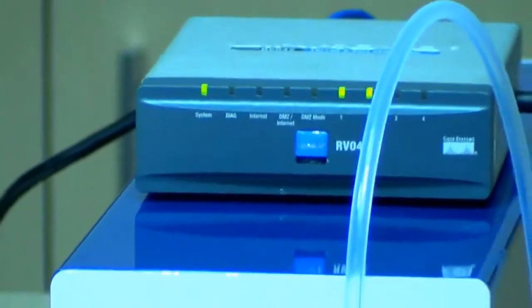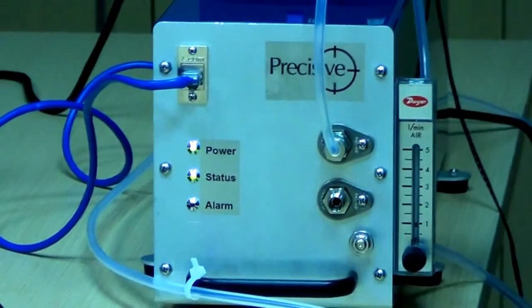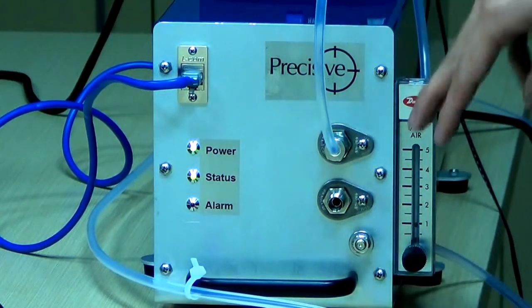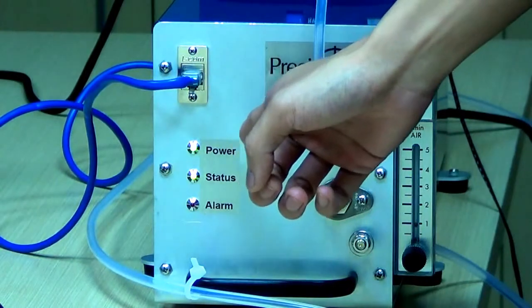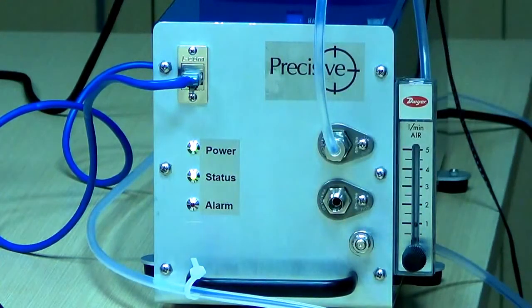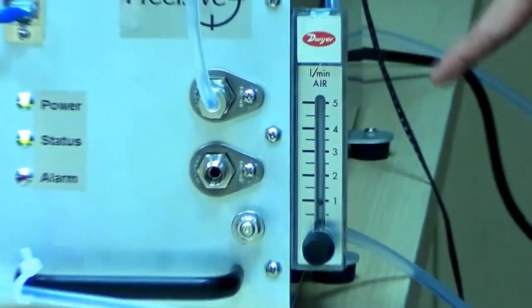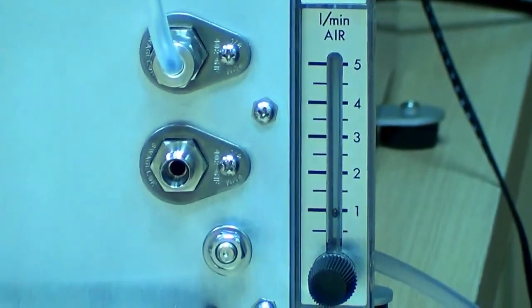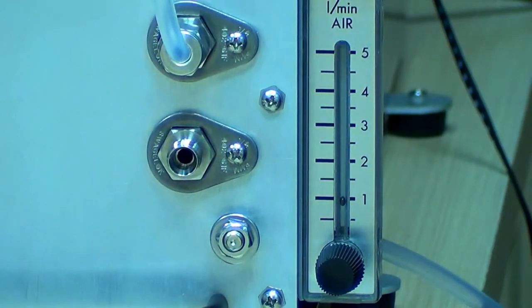The third part would be the Precisive analyzer itself. As you can see, there's no local display here. All of the local display would be in the HMI that I've shown earlier. There's only three LED lights here, which are the power, status, and the alarm. The fourth component is a rotameter. This is set at 1 liter per minute or 60 liters an hour. Right now we're going to set it as 1 LPM.